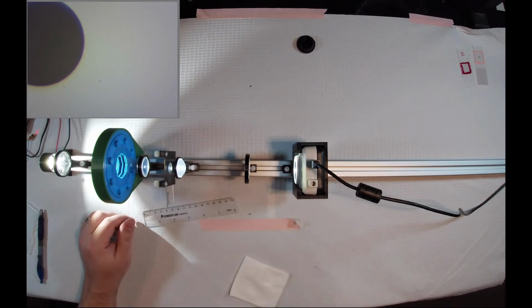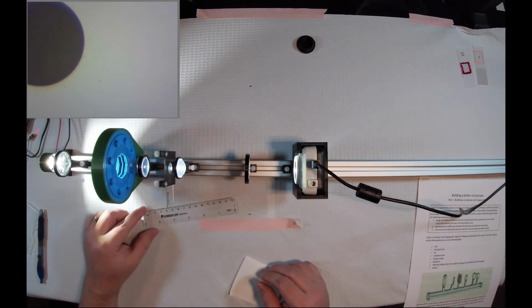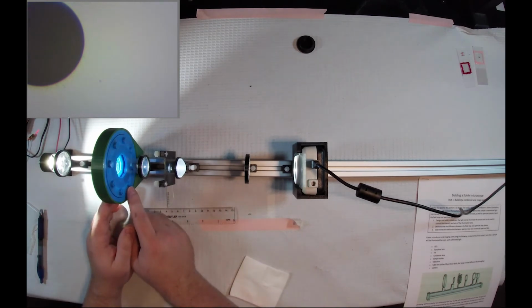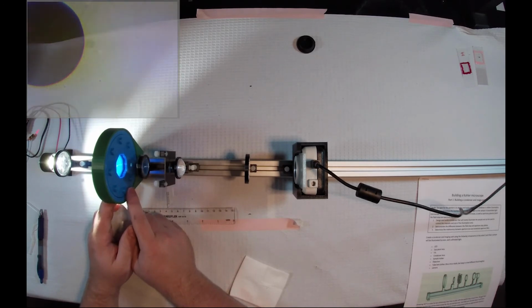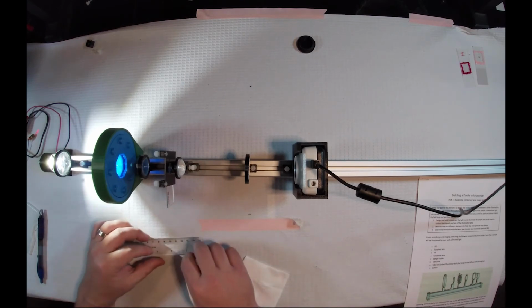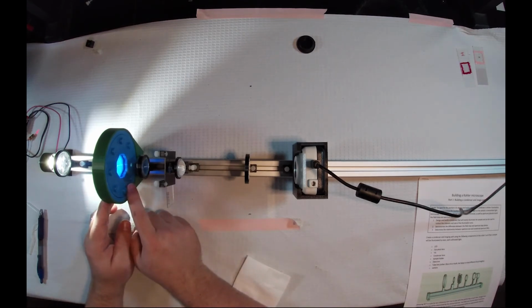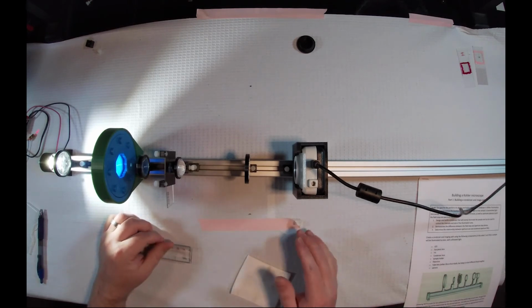So in the lab, it asks you to calculate what is the numerical aperture if the condenser is fully closed, if the aperture stop is fully closed. Now I've already taken some measurements before I started assembling this, but you'll know from the last lab the iris doesn't really close all the way. This isn't a perfectly blocking iris. It closes down to a minimum diameter of about 1 millimeter. That's why we're getting just a little bit of light let through.